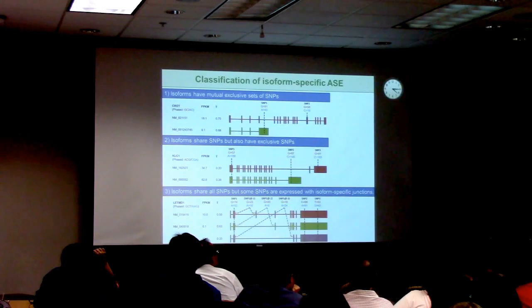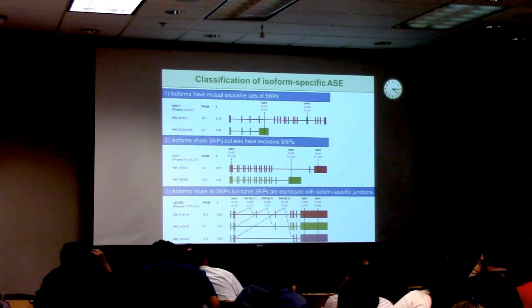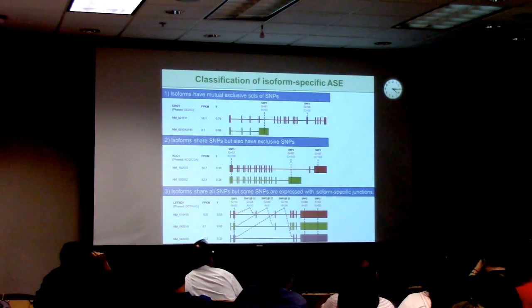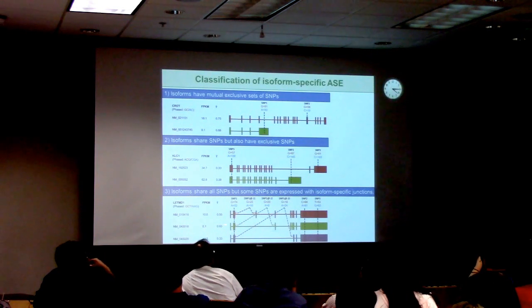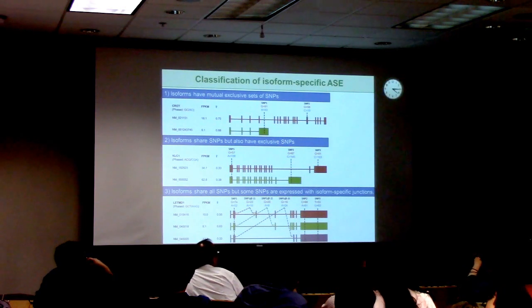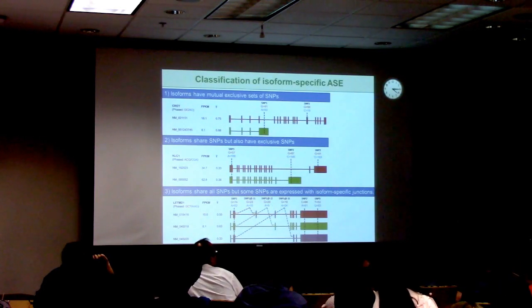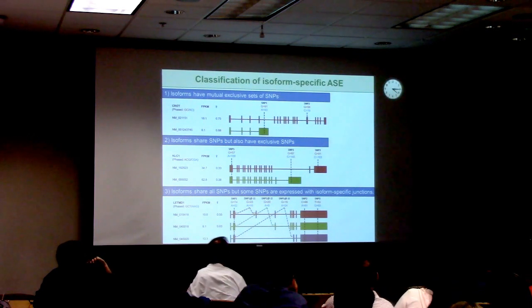And then we use these numbers of reads as the Y value in our Poisson model. Then we can calculate the expression, the FPKM, for the 3 isoforms. We find the first isoform has almost no preference for the reference allele or the alternative allele, because it's close to 0.5. However, the second one prefers the reference allele, because it's 0.6. And the third isoform is close to 0.3, so it prefers the alternative allele. That means within a gene, you have 3 different patterns of allele-specific expression. If you merge them together and calculate at the gene level, you cannot see this.